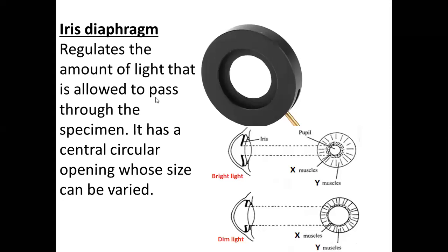down there below the stage. Some microscopes, the diaphragm is just next to the stage. It looks like a knob ya TV ama ya radio. Ukizungusha unaona mwangaza ukiwa mingi ama ikipungua. So make sure that anytime you have an opportunity to operate a microscope, you see those parts very clearly.